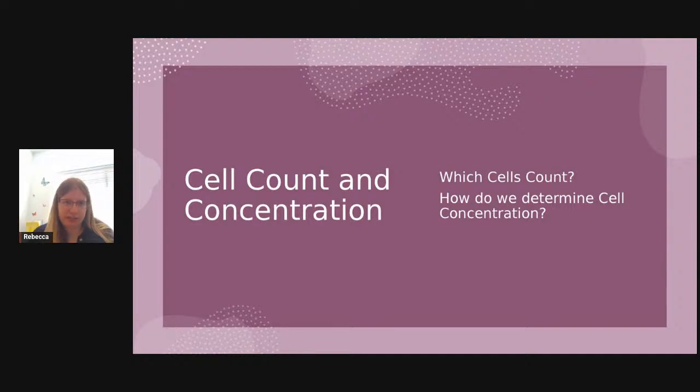in these grids that we've created on our slide, right? We're just putting some liquid on the square or on the slide. And so we need to make sure that we know which cells we should count and which cells we shouldn't count based on where they are.